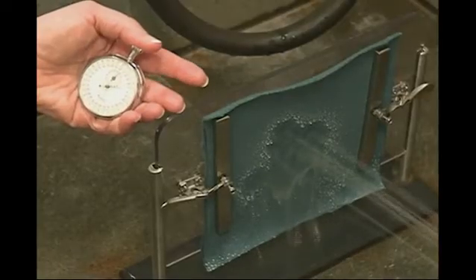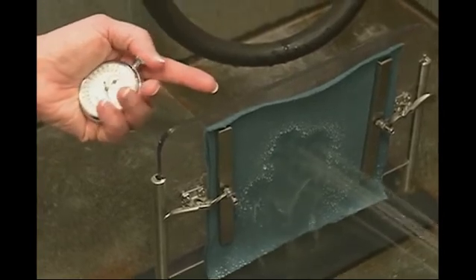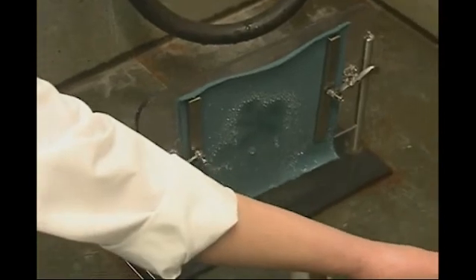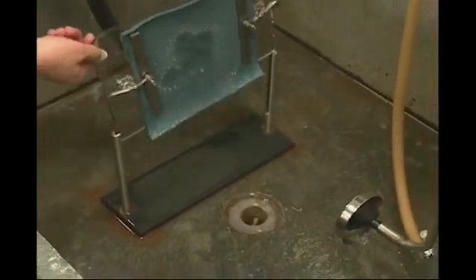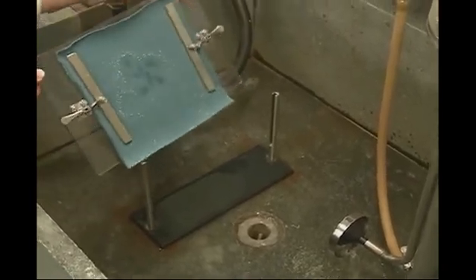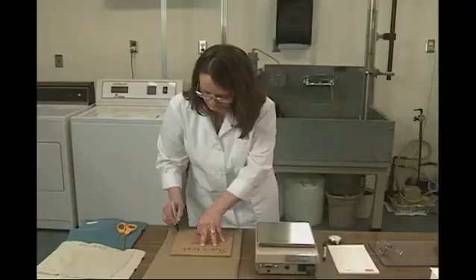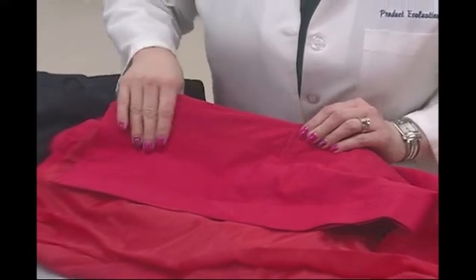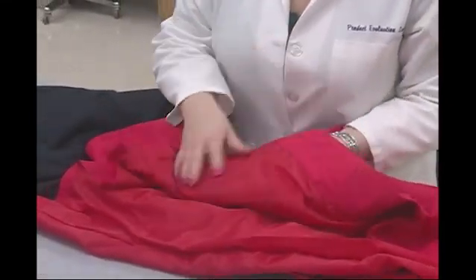The unique aspect of the rain test is that three specimens are tested at each increasing water intensity level to determine the maximum head pressure at which no penetration occurs, the change in penetration with increasing pressure, and the minimum pressure required to cause a breakdown or the penetration of more than five grams of water. The test can be performed with a single test fabric, two layers of fabric, or a fabric intended for raincoats with its lining fabric.